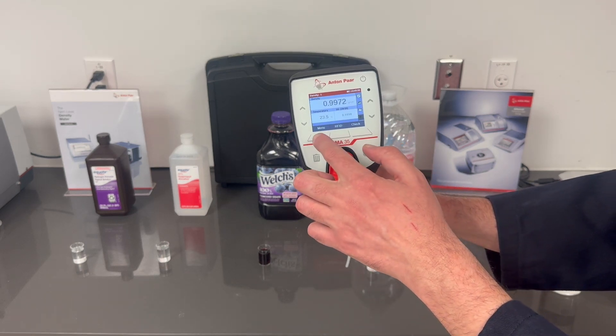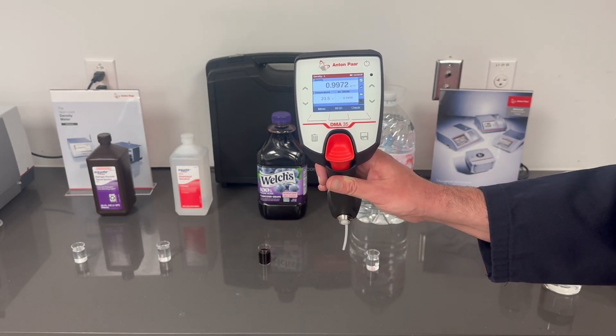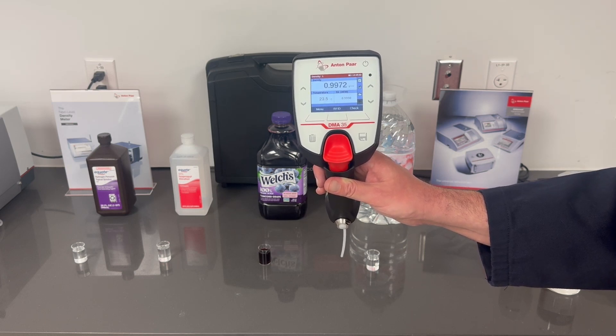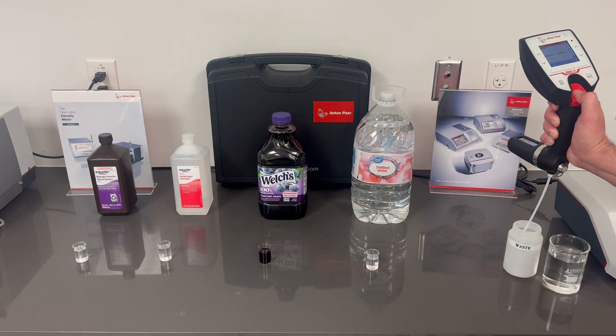Let's go back to the main menu and look at our density — 9972, right on point. We'll empty into our waste container and move on to the grape juice.